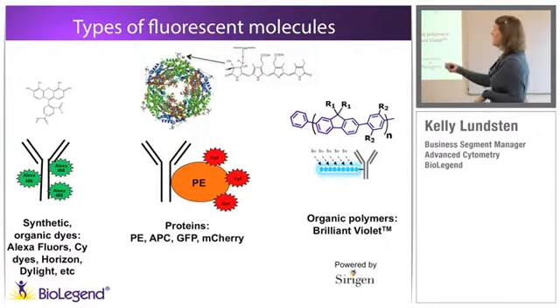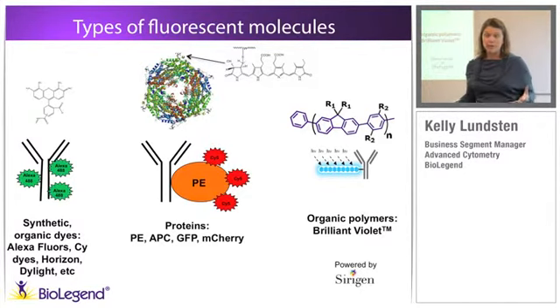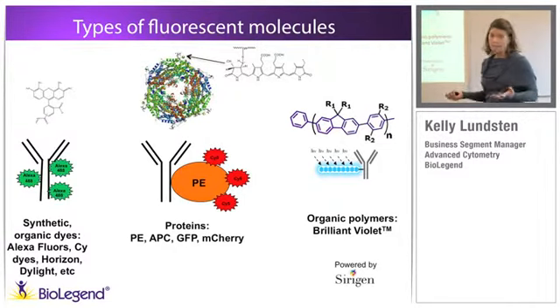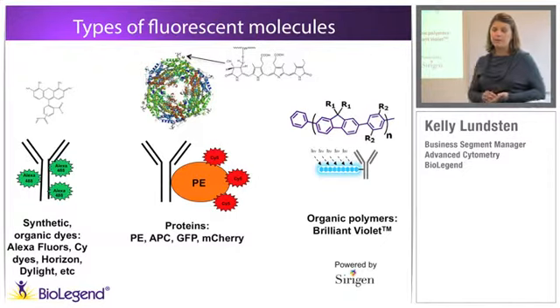antibody. Versus proteins like GFP, PE, APC, PerCP, they're all derived from nature. And all of these fluorophores are actually embedded in that protein structure. So I like to use this example of basically one subunit of phycoerythrin, because as this arrow is pointing to, there are these molecules called bilins that are embedded within the protein of the actual phycoerythrin itself.